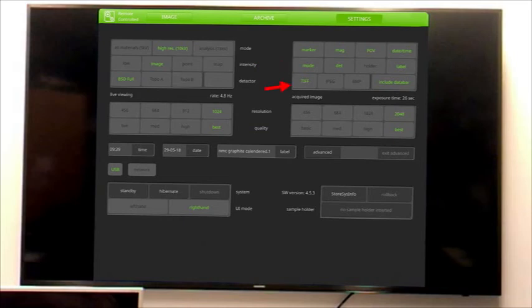The last little line here corresponds to what sort of image file you will produce when you take your image. TIFF files are rather large. They are a mostly non-compressive form of image taking, so you really won't lose any information. So if you are doing something like porosity measurements, that might be nice, as you won't run into the issue of compressing your image and potentially losing data. JPEGs will be smaller images, and do compress a little bit, so if you are doing post-processing and image processing on whatever your SEM photo is, keep in mind that JPEG may not be quite right for you. I'm not quite familiar with BMPs. I would assume that's another form of compressed image file, but further work should be done into that.